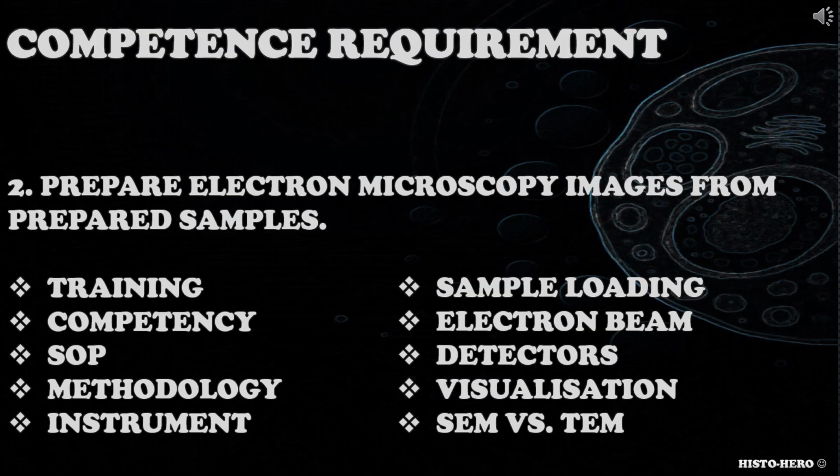When addressing this competence requirement, candidate could consider their training and competence, SOPs and method used, instruments used, sample loading, electron beam, detectors, visualization, SEM versus TEM.